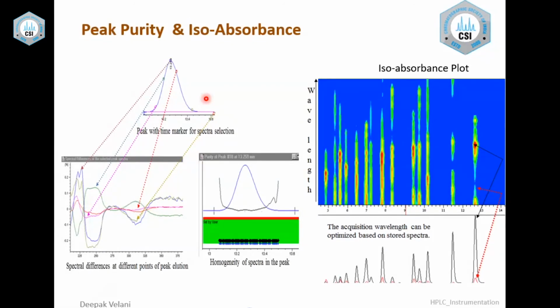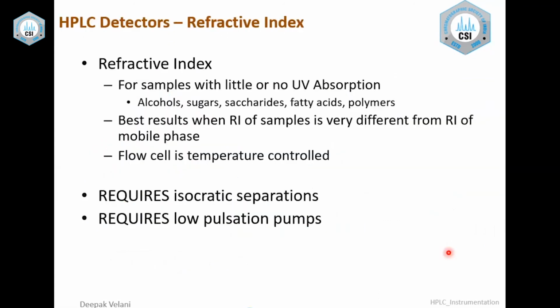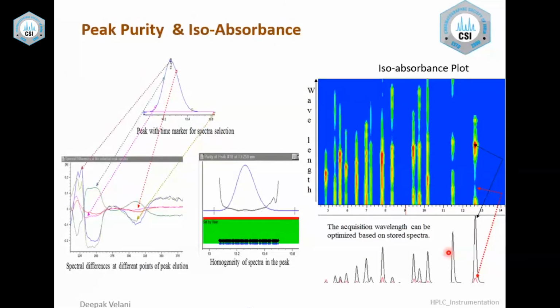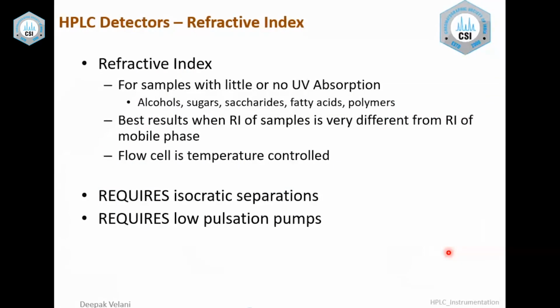Okay, so in basics, this is a very important tool, and you can see that the peaks are over here. This is a kind of TLC-like iso-absorbance plot, which has been shown over here. So I'm sure with the UV-VIS and PDA detectors, you have understood the utility and advantages as regular routine detectors in any analytical lab.